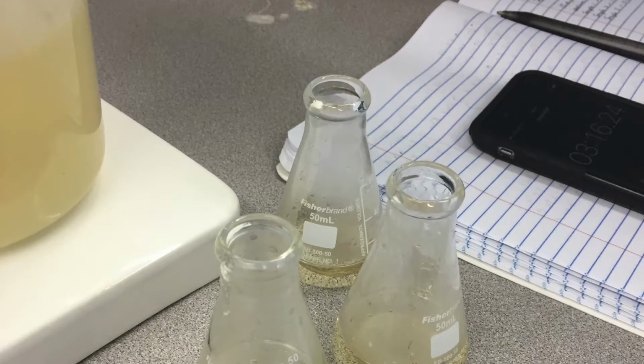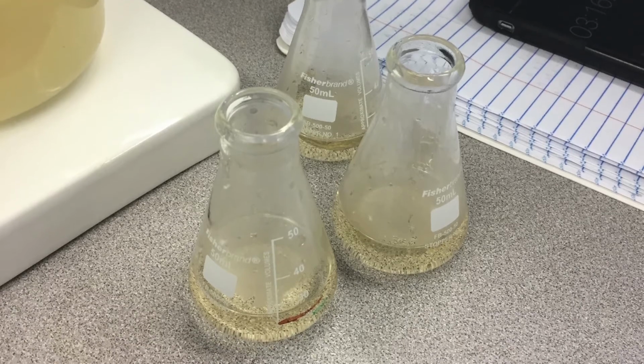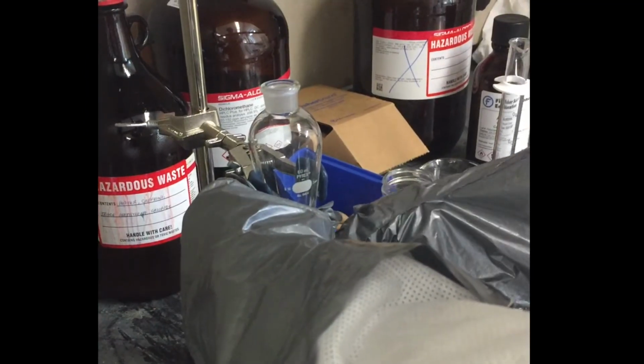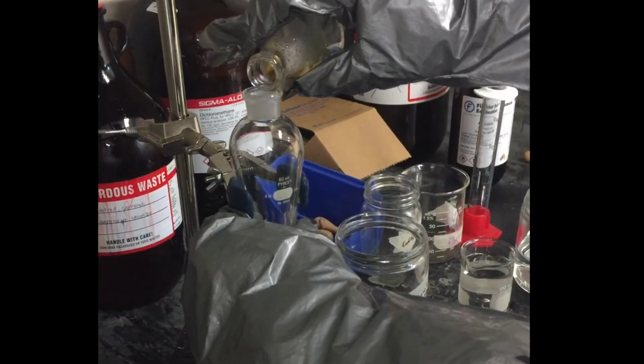The next step involves taking the 3 samples over to the fume hood. First thing to note is that the individual working under the fume hood must be properly equipped with silver shield gloves and a full face mask due to the work required with dichloromethane. Under the fume hood, dichloromethane, or DCM, is very carefully handled in the following steps.